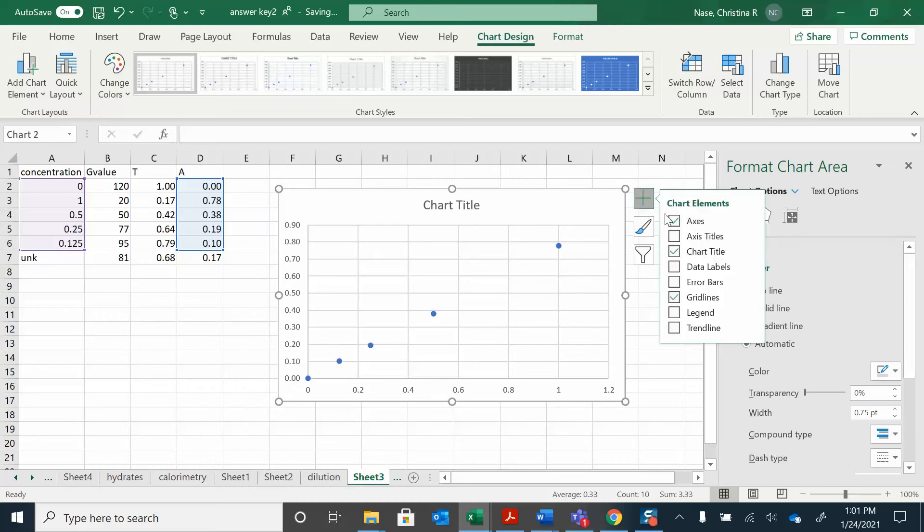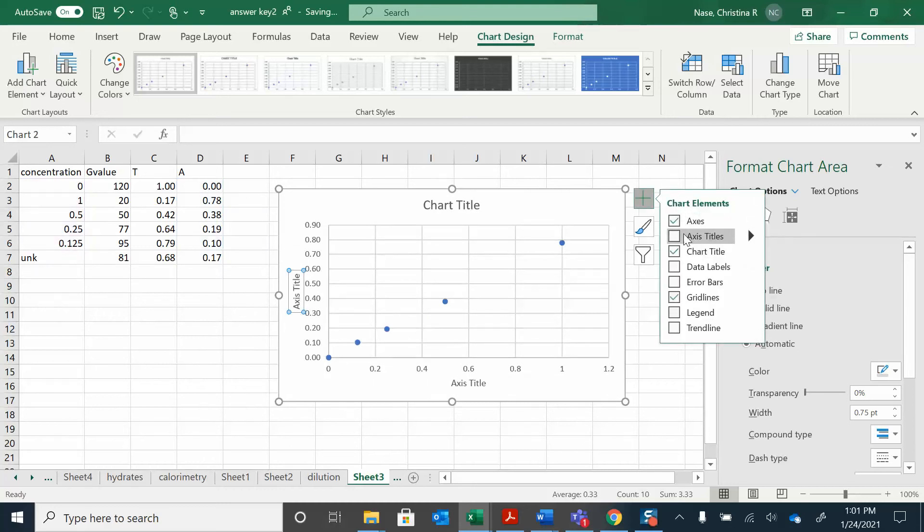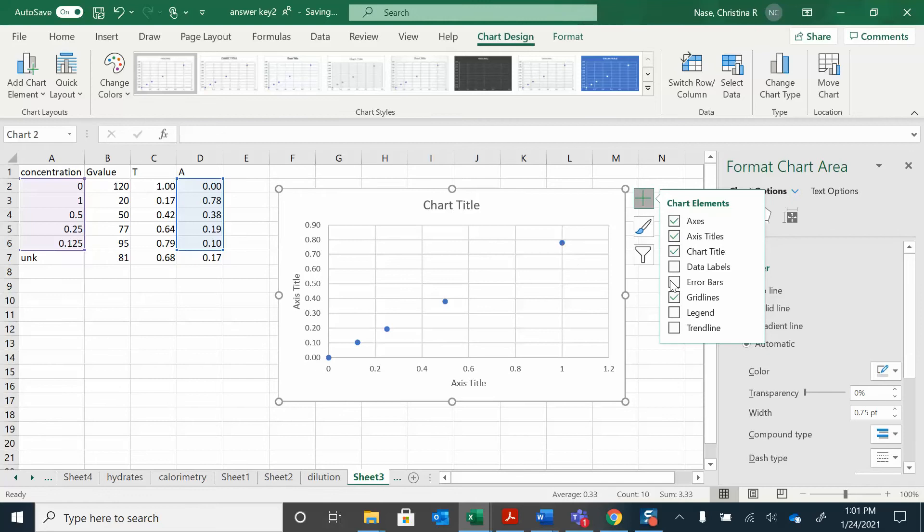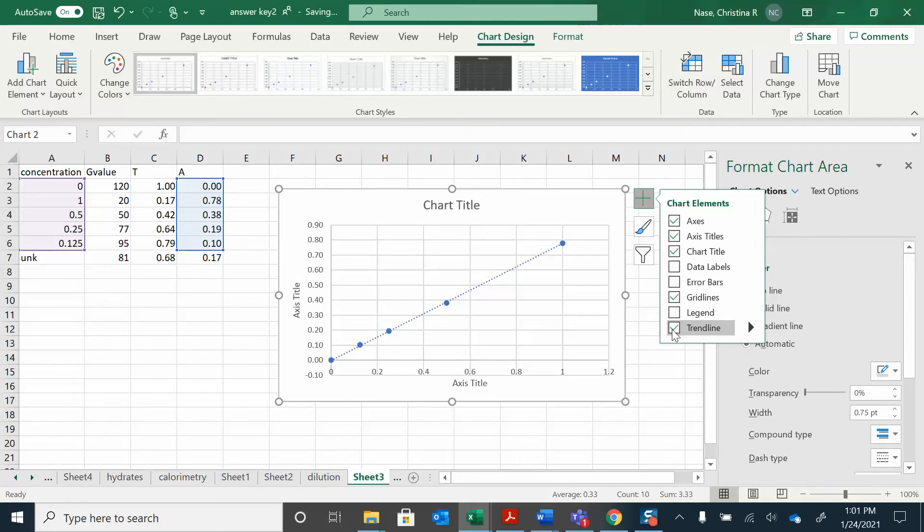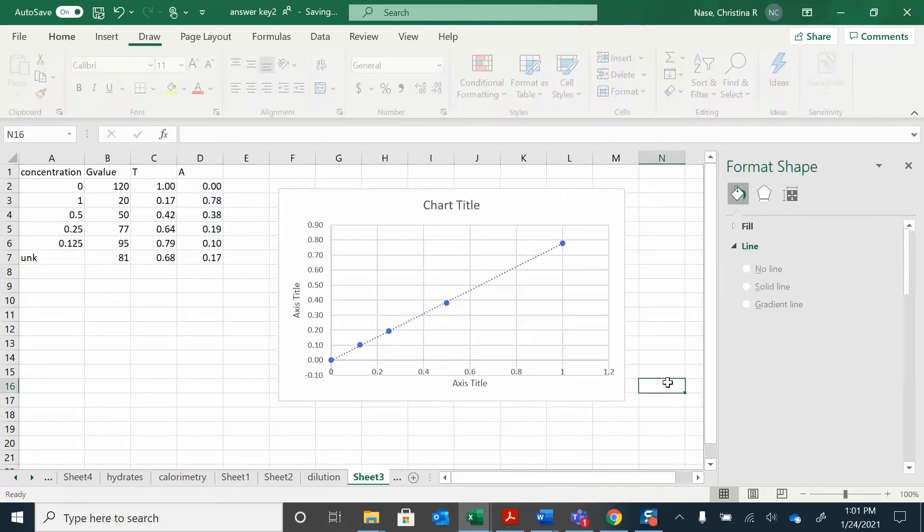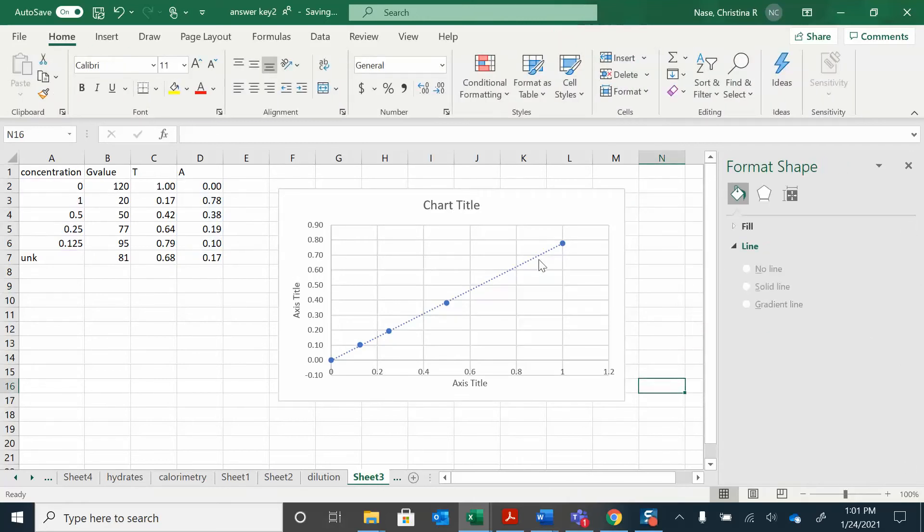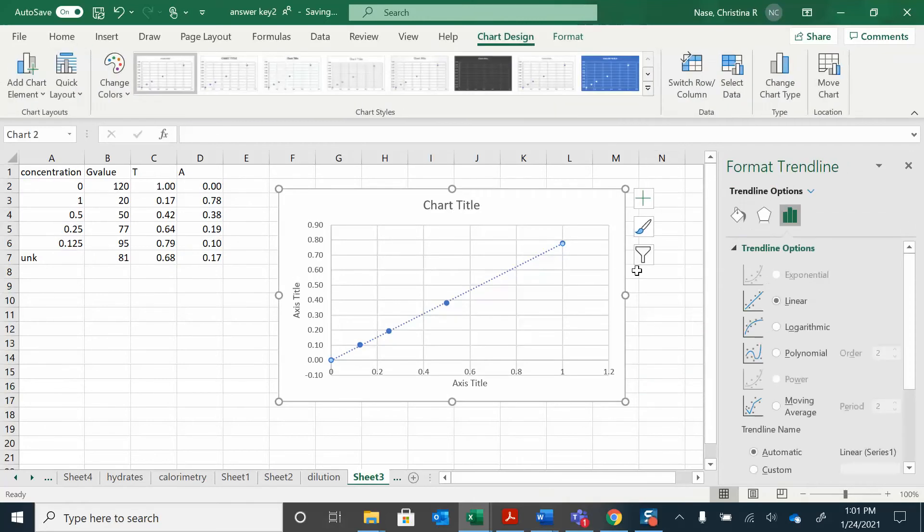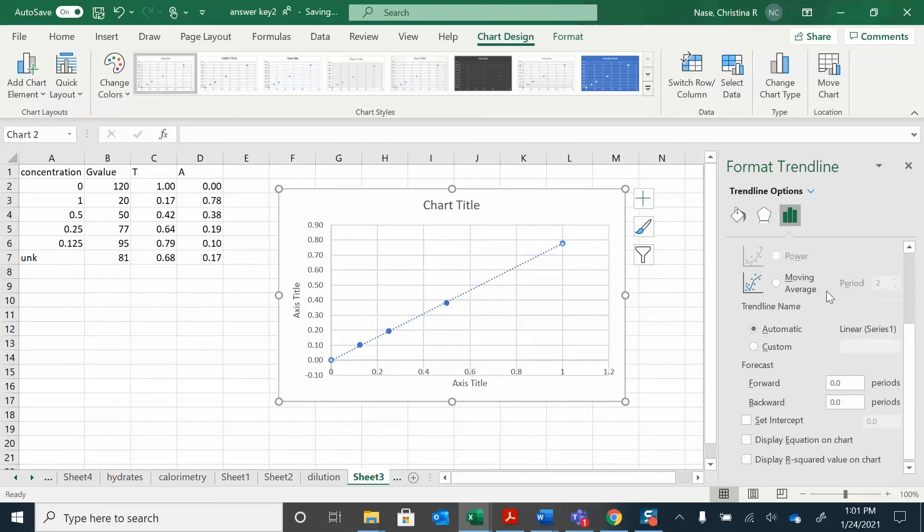If I give myself a plus sign there I can add some titles. What else can I do? I can add this trendline. Great. And then if I want to show the trendline, I can just click on this line now, scroll over here, and say display the equation on the chart.